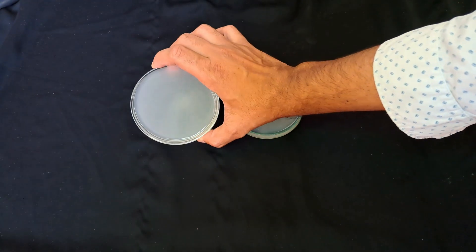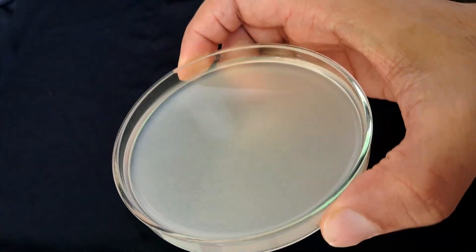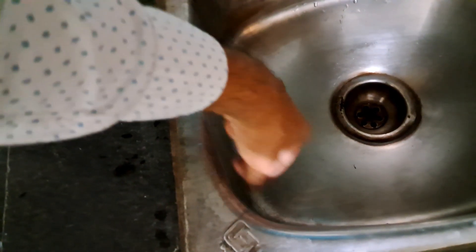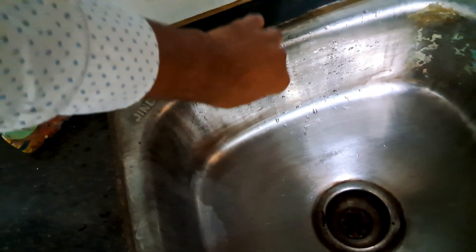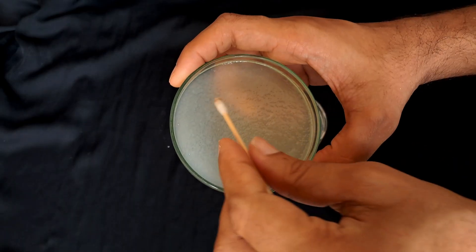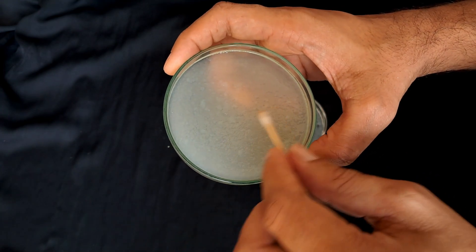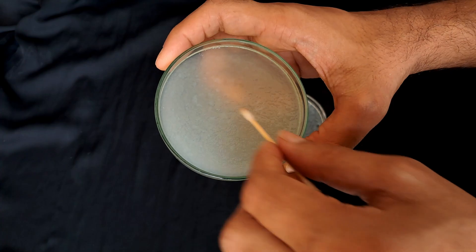It has a jelly-like texture. Now we have to stick the bacteria on it, so I am collecting the bacteria samples from the kitchen sink. To get a proper bacterial colony, we should spread them evenly.